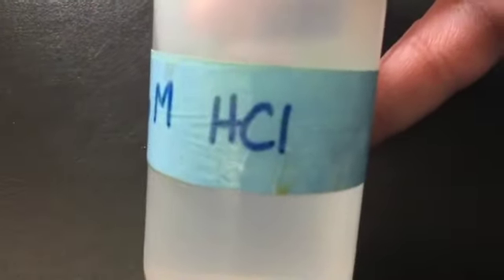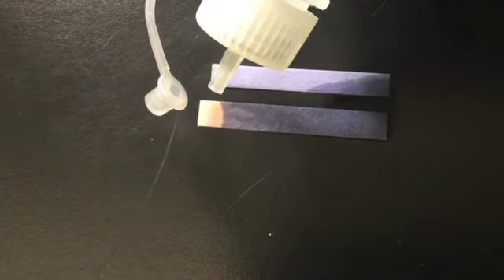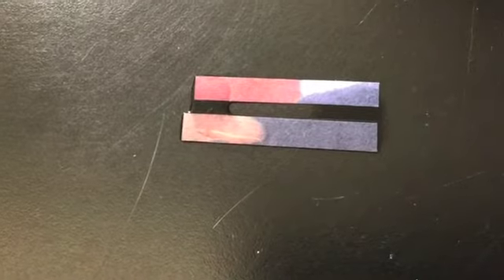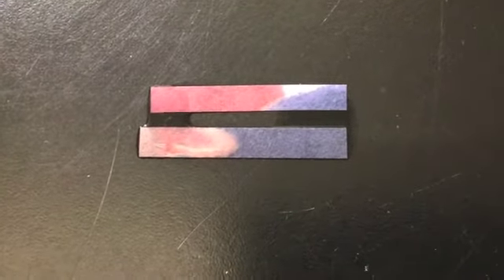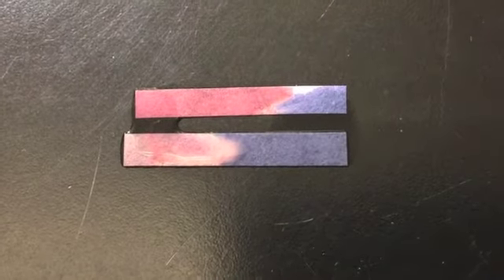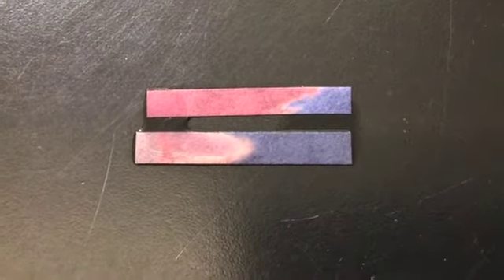Now I'm going to do the same thing with an acid. In this case, 6 molar hydrochloric acid. I'll place this at the other end. The acid causes the pink litmus paper to return to its normal color, and it causes the blue litmus paper to become a darker red. In this way, you can know whether something has reached into the base range or the acid range.